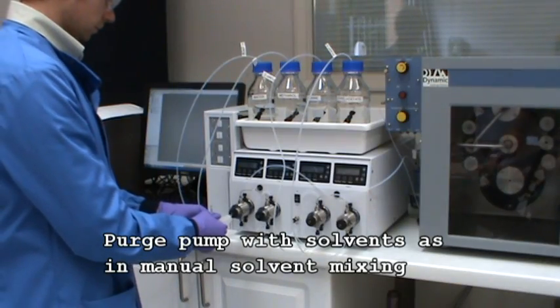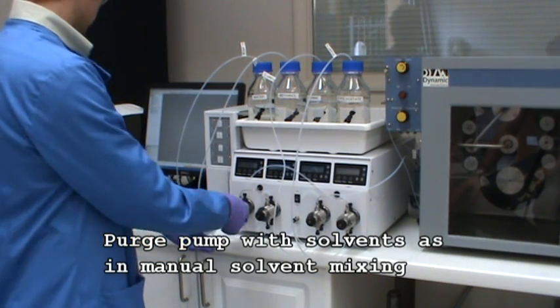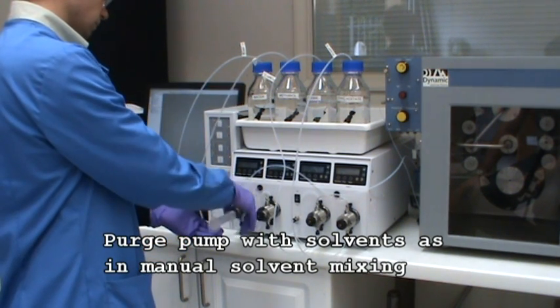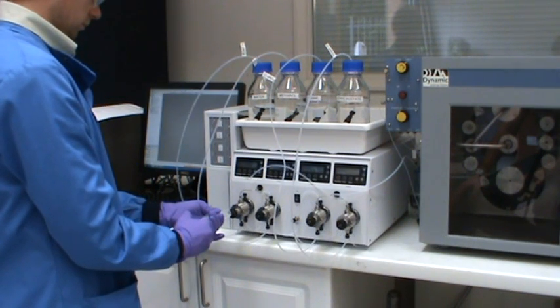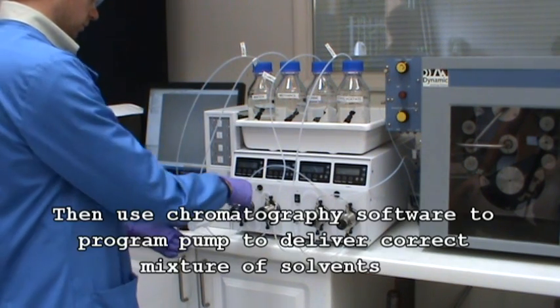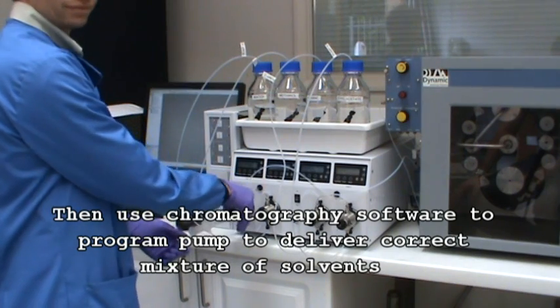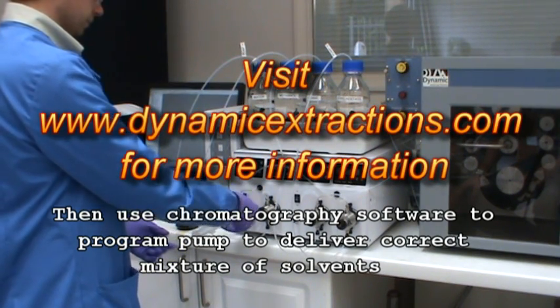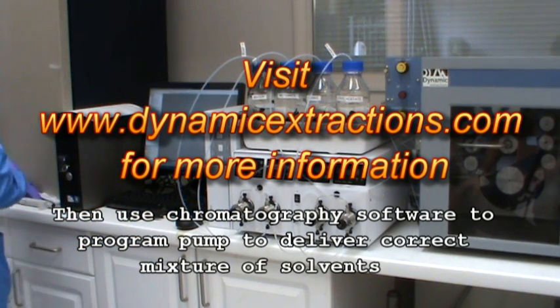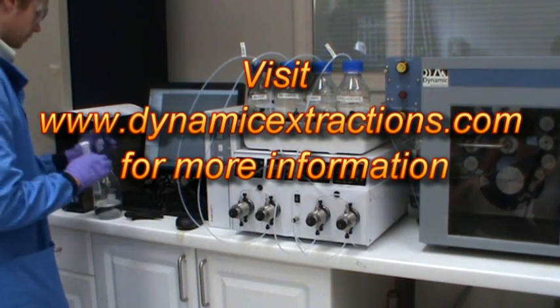Once you have purged each of the pump heads with the solvent it is going to pump, you can program the chromatography software to deliver each of the solvents in the correct ratios to mix up the solvent system you want to use. This is the essence of on demand mixing and it greatly improves throughput and reliability of solvent system mixtures on small volumes.